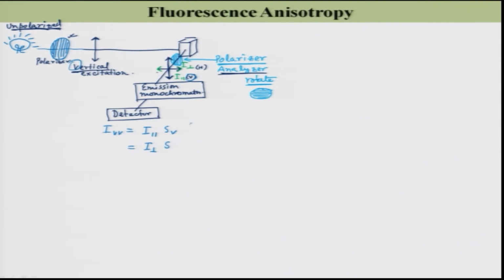But for horizontally polarized light, this sensitivity is not the same as for the vertically polarized light, they are different.